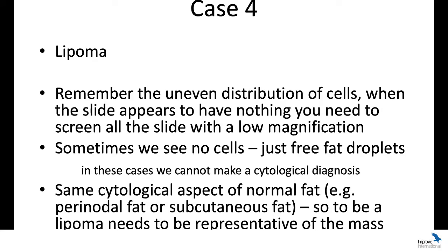And I'm pretty sure that you have a picture of a liposarcoma in your handout that you've had from the practical session. If not, if by any chance it isn't there, just pop me an email and I'll put a couple of images of liposarcomas for people to compare. But it looks very different, even though macroscopically, when you aspirate from the animal, it can come out looking as fat.